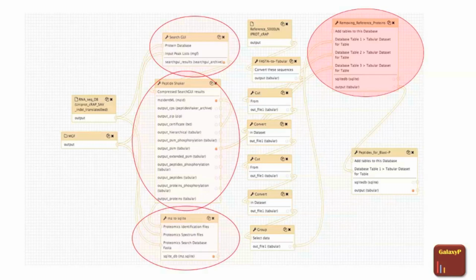It helps you perform some more complex analysis on your tabular inputs and get outputs from that. So instead of processing these tabular files in multiple processes, you can have it in one place and then perform more complex queries on that to get answers. And eventually what comes out of this is that you identify peptides that we think are novel, in the sense that they are not present in your reference proteome, and then you can take those peptides and subject them to BLAST-P analysis.